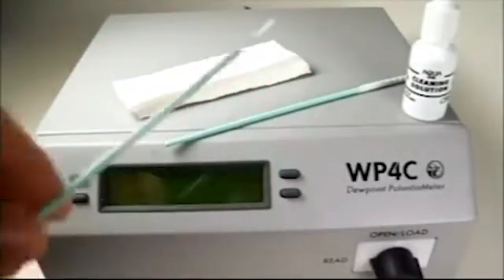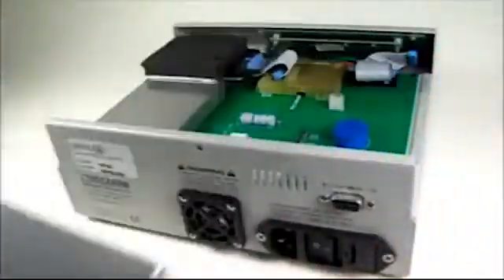Here's how you do it. First unplug the power cord, remove the screw at the back, and take off the lid. Opening the lid and working on an instrument may seem intimidating, but as you'll see it's safe to do.